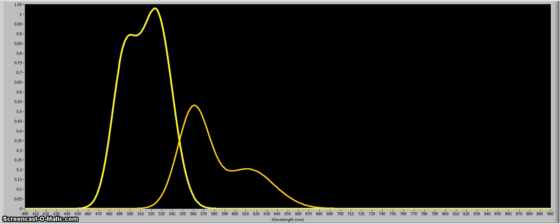These 2 items will be important for selecting various components as well as understanding what the impact of both the absorption cross-section of a chromophore is as well as the quantum efficiency. The absorption cross-section is simply this: how many photons are absorbed by a chromophore that's in a light path. And quantum efficiency is, once a given chromophore absorbs a photon, what percentage of the time is that absorbed energy emitted back in observable fluorescence? As we will see shortly, both absorption cross-section and quantum efficiency can vary markedly for different chromophores.